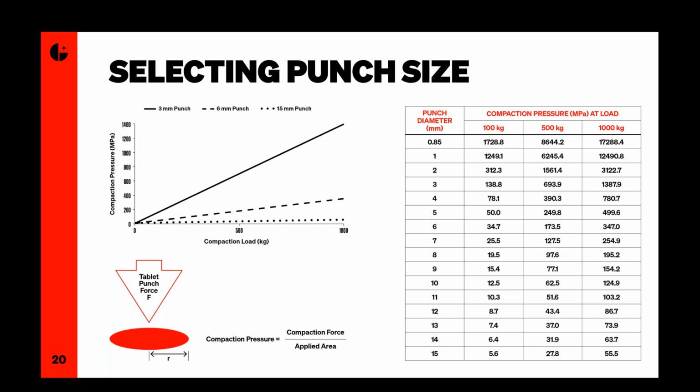Or if you're looking to change supplier, you can focus on that material itself as opposed to the full blend. But if you're building up a formulation, then obviously you need to be working with a mix at some point. You might look at each individual component to begin with, but as you build up your blend, you need to be looking at a combination of the components.